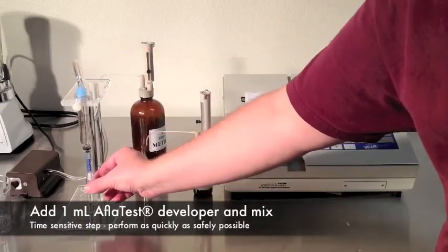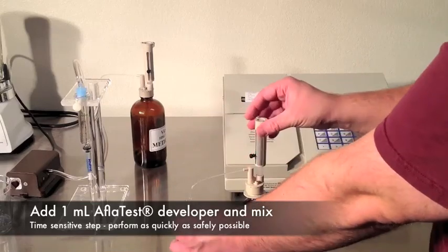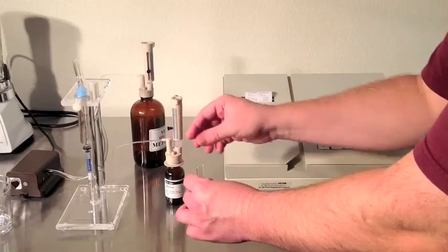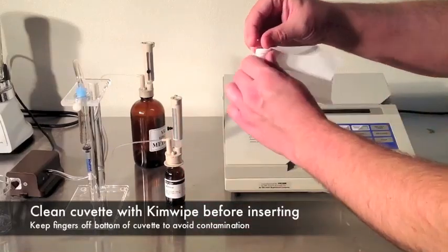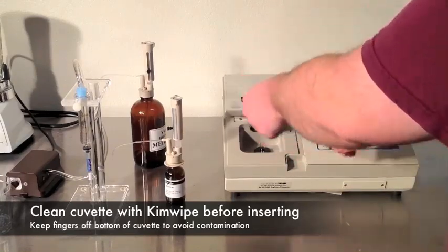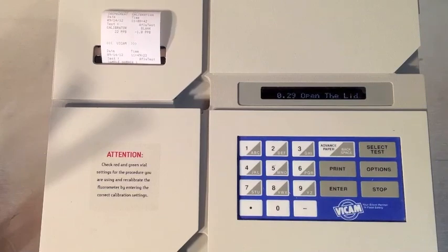Remove the cuvette. Add one milliliter of fresh AFLATEST developer solution. Mix. Then clean the cuvette with a fresh Kim wipe before inserting into the fluorometer. Because you checked your calibration settings with the yellow standard, the fluorometer was set up to test for aflatoxin and was waiting for your sample. After 60 seconds, your results will print and appear on the screen. Remove the sample, and you're ready for the next test.